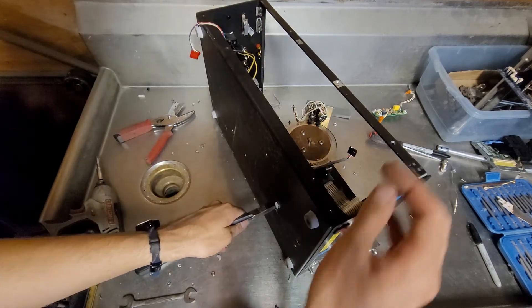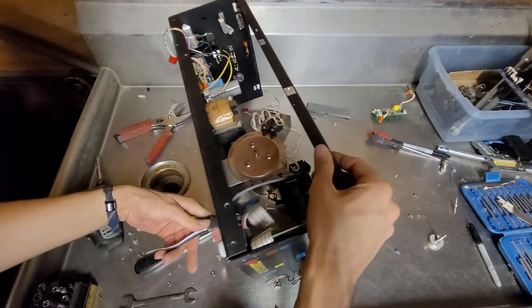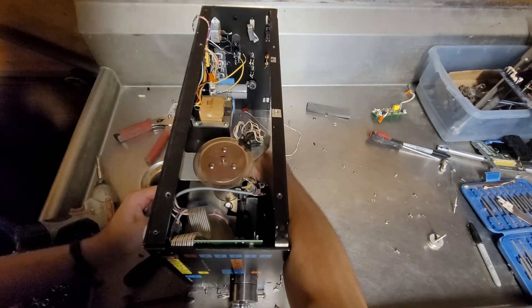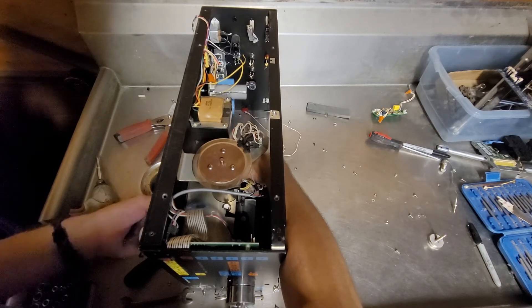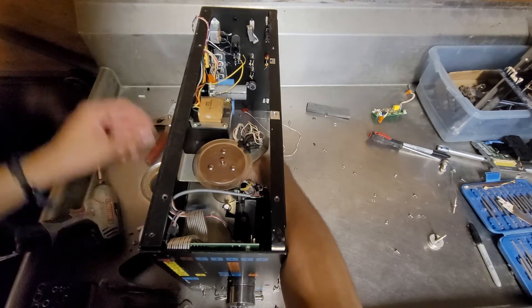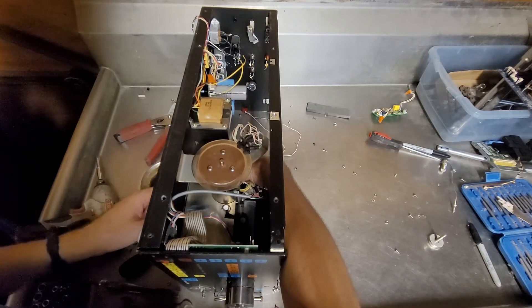I can't imagine these four screws are the only thing holding this on, but it's starting to feel like it. Also, I'm surprised they used stainless steel for the rotary encoder — I'm assuming it's stainless. That's pretty aggressive.